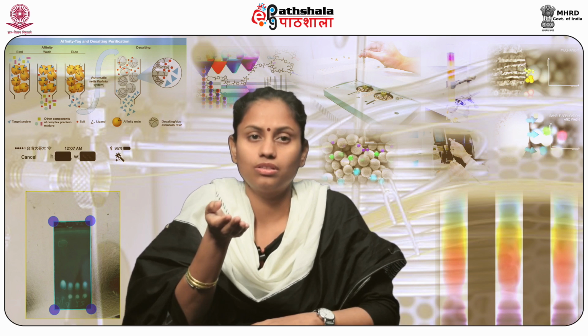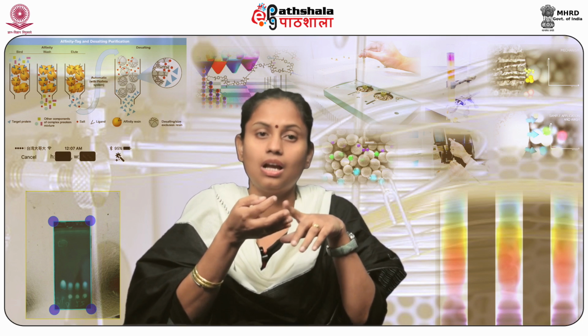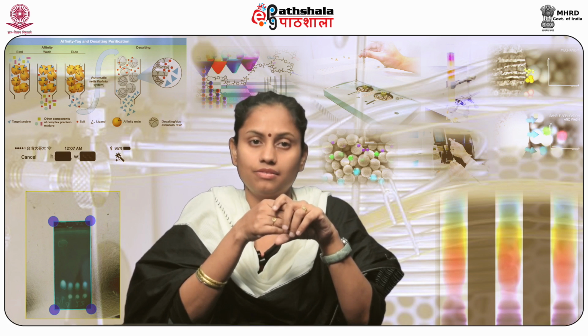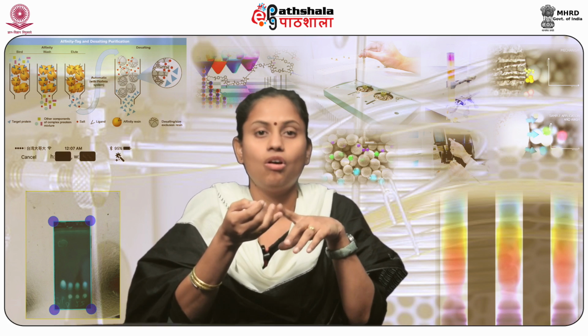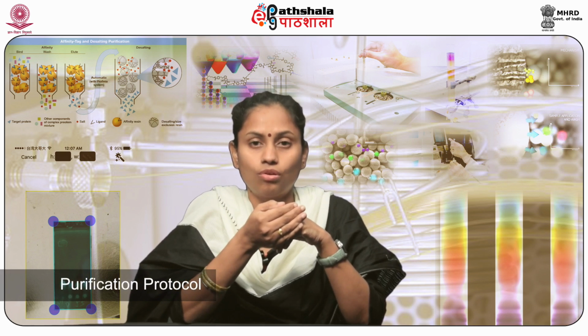In ion exchange chromatography, the stationary phase is a solid resin which can be either cationic or anionic, whereas the mobile phase employed here is a liquid. Now, on the basis of the type of resins that are used, ion exchange chromatography is classified either as cationic or anionic exchange chromatography.